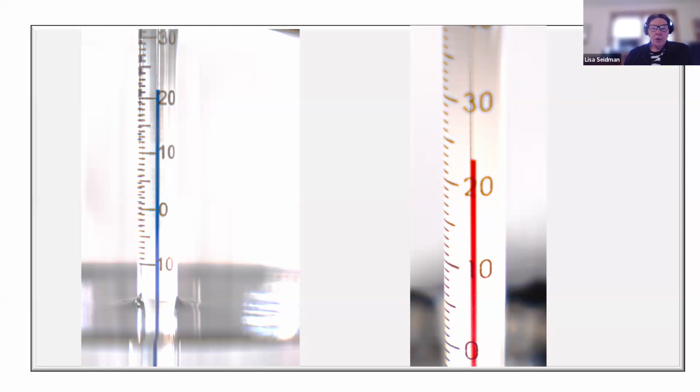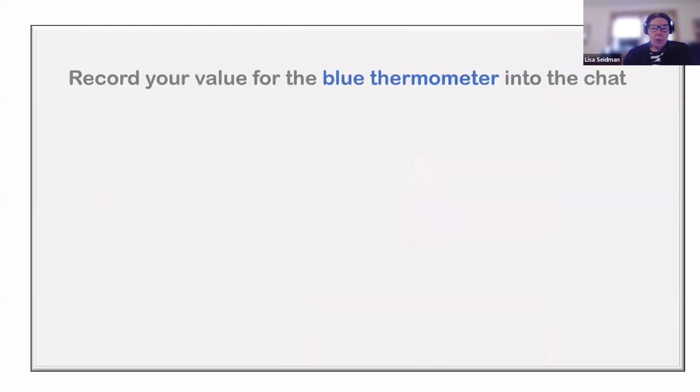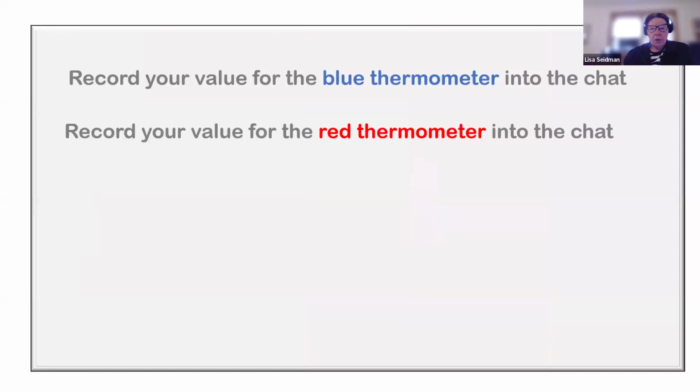And in fact, it's really great if people make mistakes in class, because that's where we want to make our mistakes. And we can use mistakes as an opportunity to learn. So that's how I would cue the students. So now we'd like you to record your value for the blue thermometer into the chat and your value for the red thermometer.